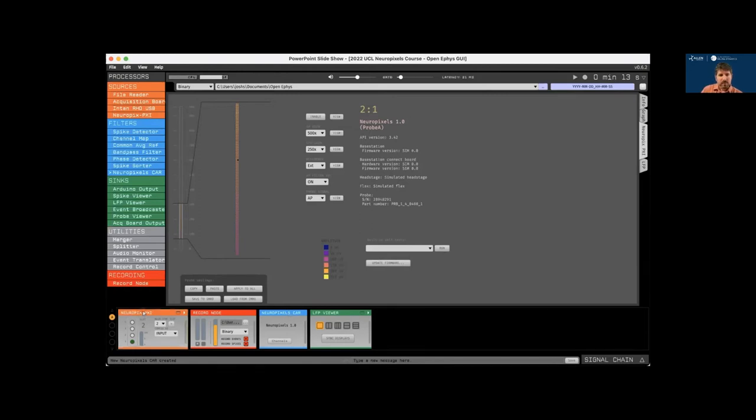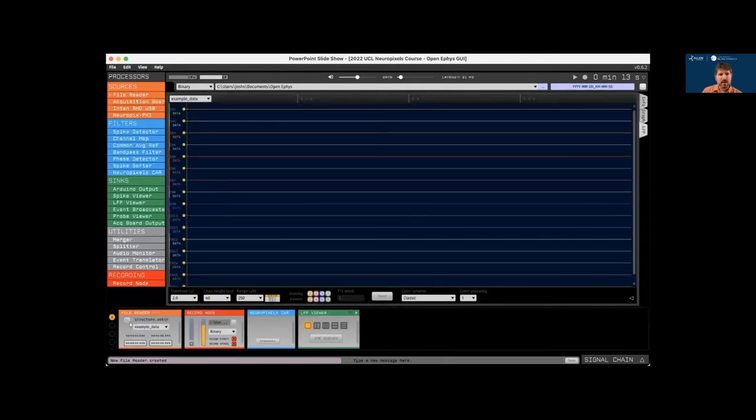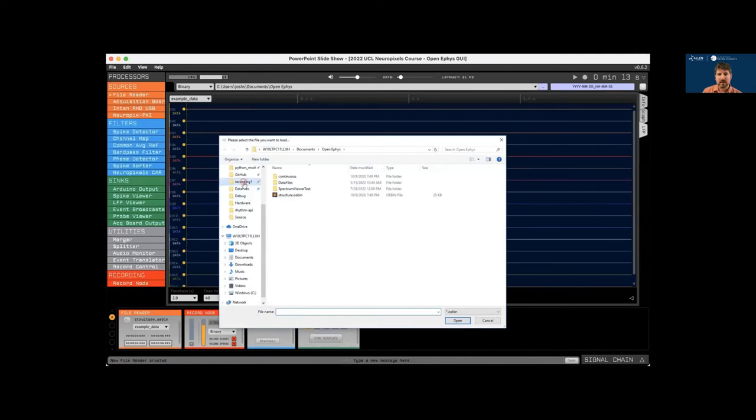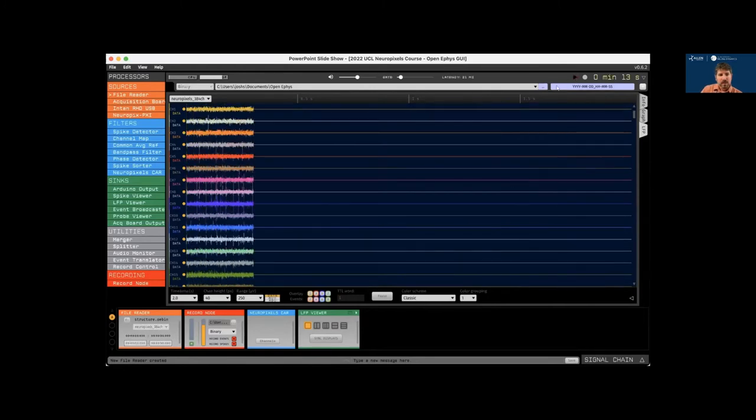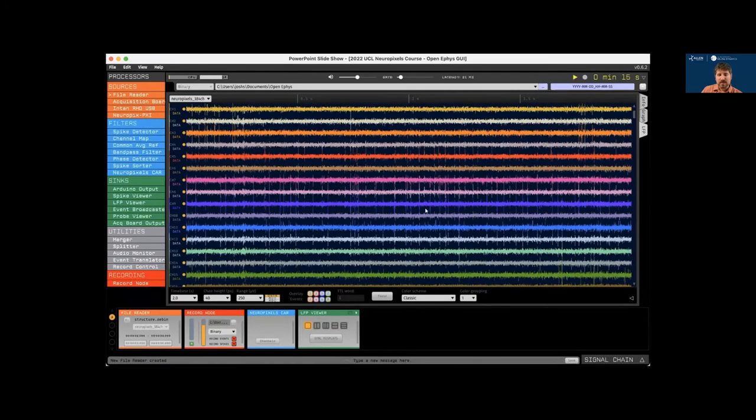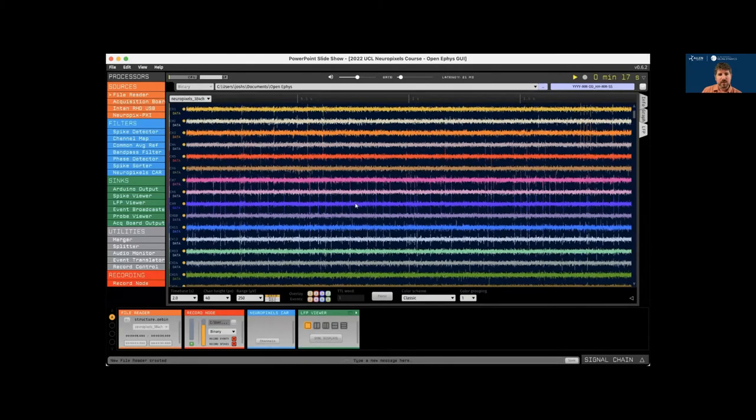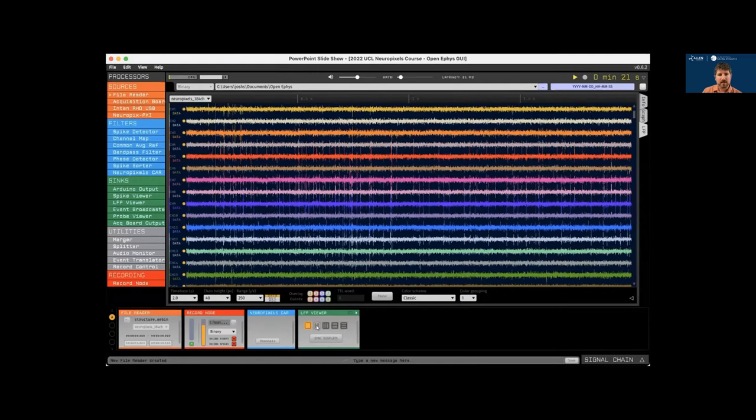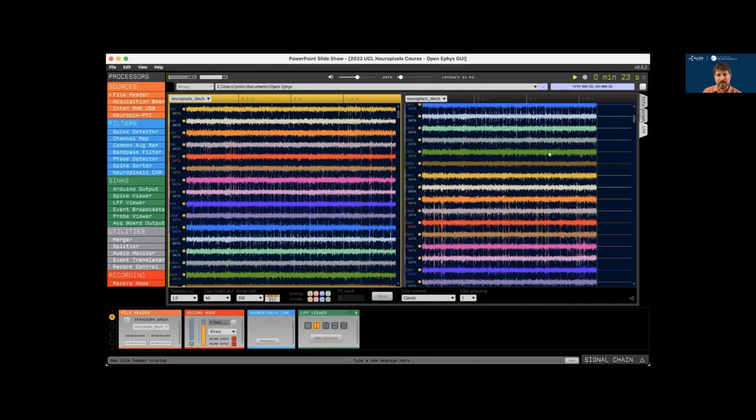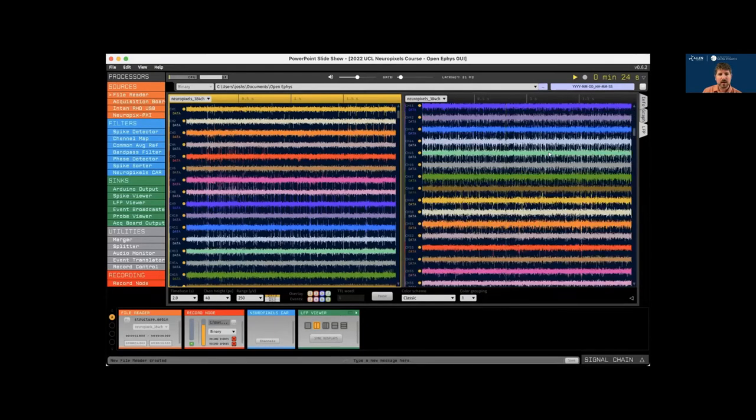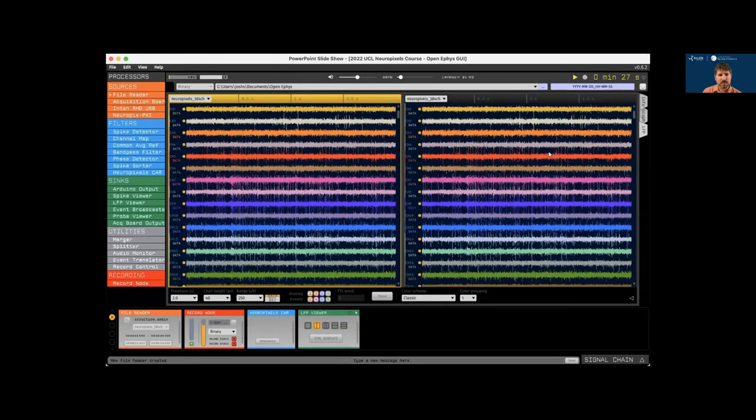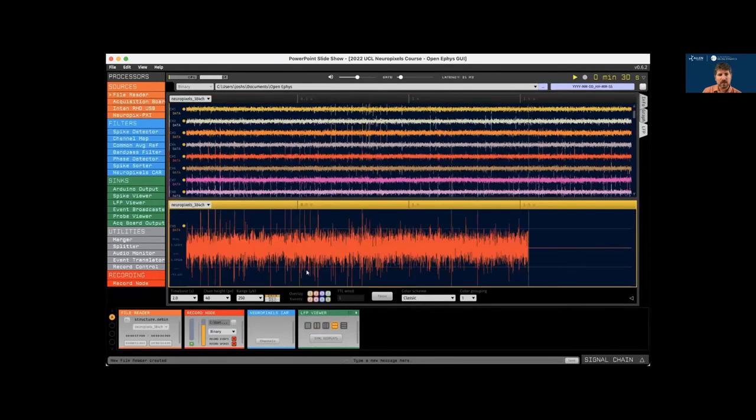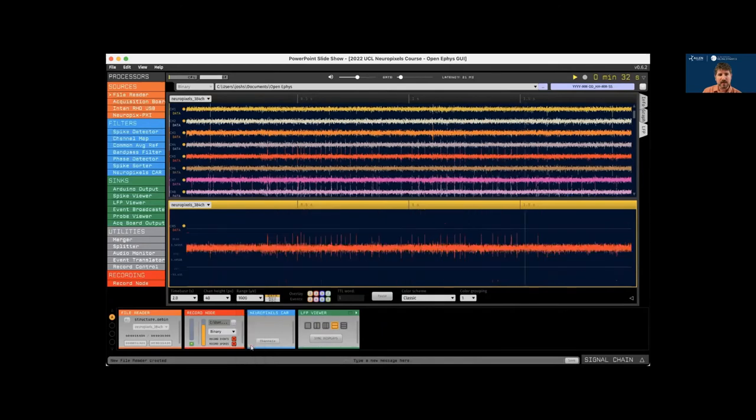All right. So before we talk about real time visualizations, delete the Neuropixels plugin and replace it with a file reader so we can load some pre-recorded Neuropixels data. And now we will hit play to start acquisition. And now we can see data streaming in through the LFP viewer. We can scroll through it a little bit. We can split the display vertically to visualize different segments of the probe at the same time. We can split the display horizontally to visualize a single channel while we scroll through the rest of the data.